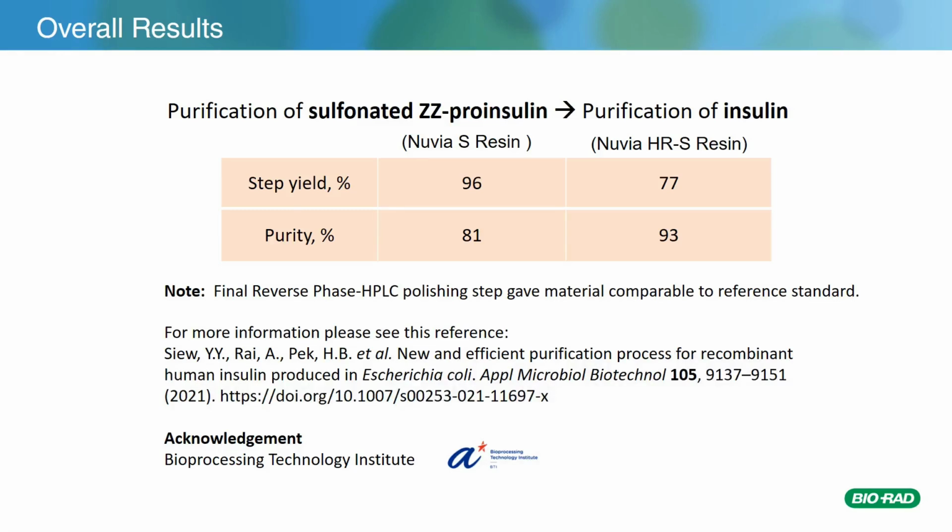Just as a note, a final polishing reverse phase HPLC step was done to get material comparable to a reference standard. And for more details, please be sure to check out the publication by our collaborators at Bioprocessing Technology Institute, who we thank very much for their work.